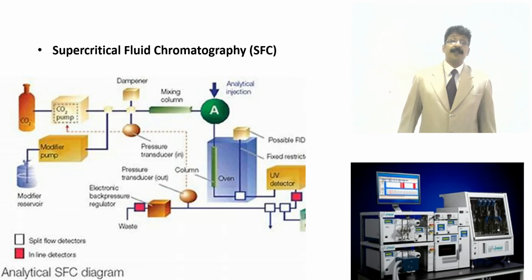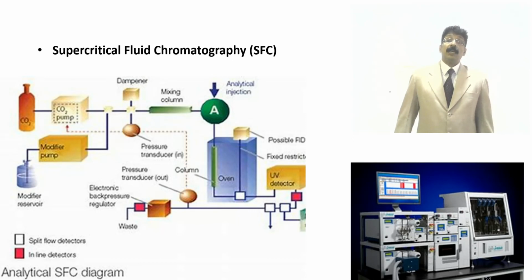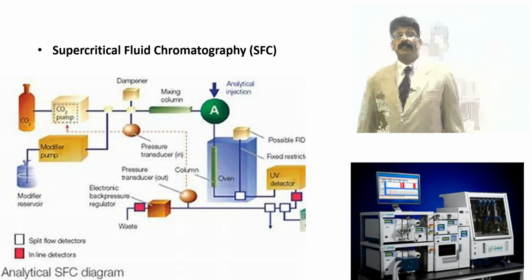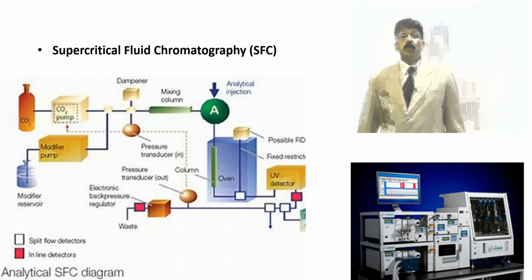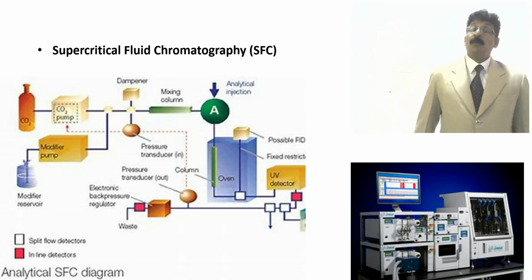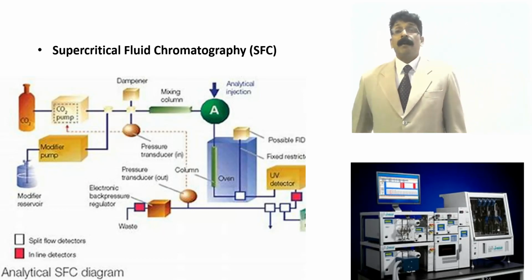has been used, and pressure has to be used, and also you are using a dampener, purger, and gas. Even if you are passing liquid carbon dioxide gas, the temperature matters, because it is a supercritical fluid, a liquid at a supercritical point, as you may know. It will be in the form of gas, and when it comes to room temperature it will become liquid.